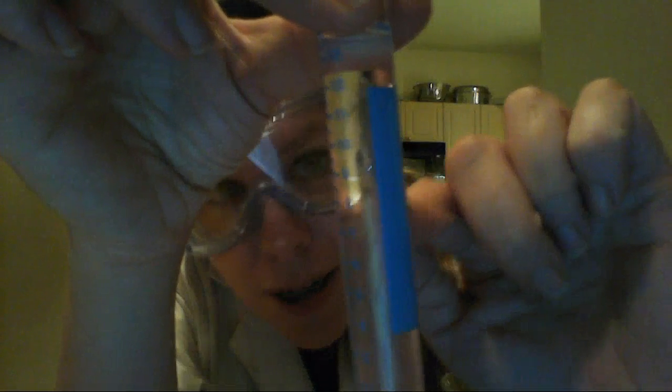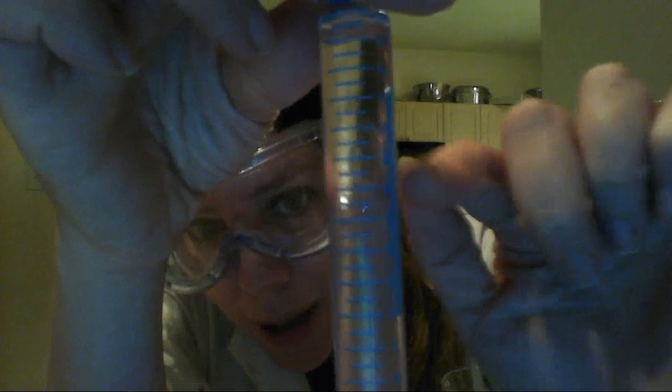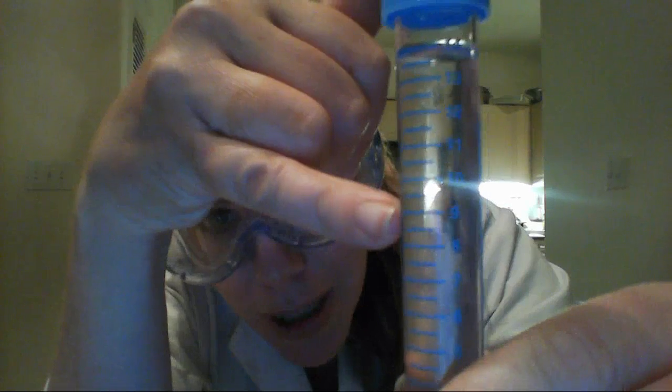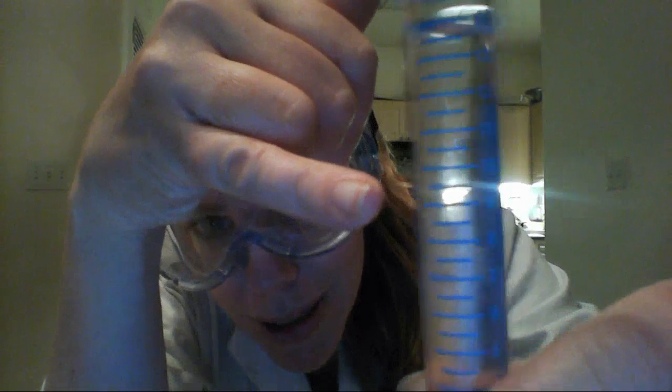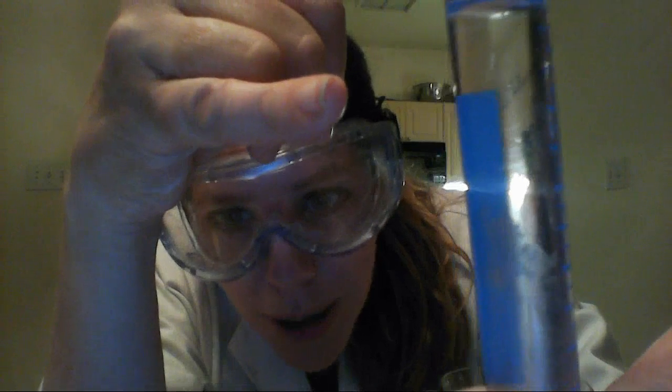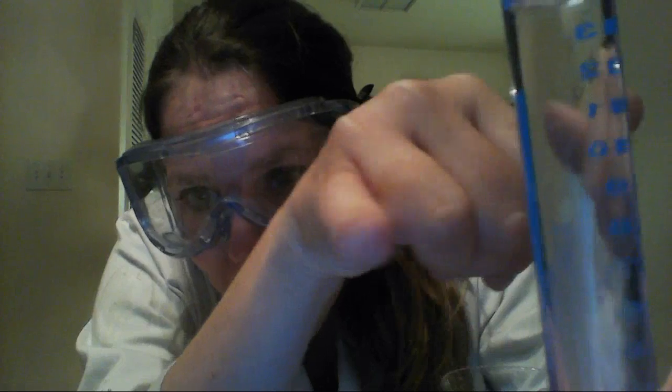I don't know if you can see, but kind of right in the middle, I have a big, huge glob of DNA. It looks like a big cloud floating in the middle of this tube here. Can you guys see that? I don't know if you can see what I'm looking at here, but it is so cool. There you go. You can see that right there.